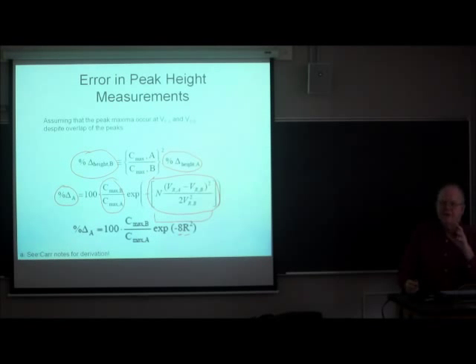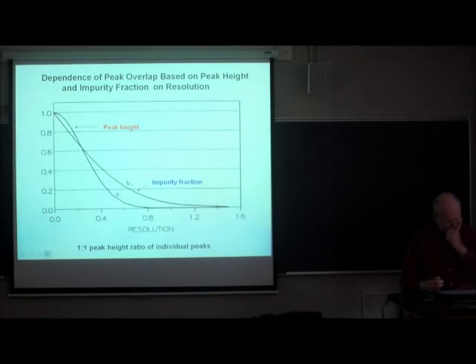What this means is the following, and it's very important analytically. Getting two peaks to decouple is much easier if you evaluate it in terms of the height of the peaks rather than the area under the peaks. It's easier to separate them by height measurement than by area measurement. And here's a plot of that.